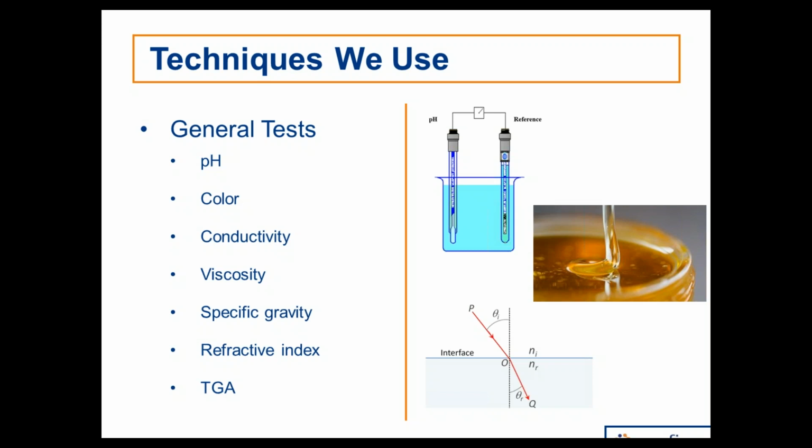So if you look at just considering pH, let's say, for example, your product typically starts out at a pH of about neutral, roughly 7, maybe a little bit higher than 7. And after some time, the pH drops. And it drops to a very acidic condition. Let's say it goes to about pH 4 or something like that. That pH change may be indicating microbiological activity in that sample. So as investigating something that's going wrong with your sample contamination, we could look at, maybe you ought to do some microanalysis on the sample.